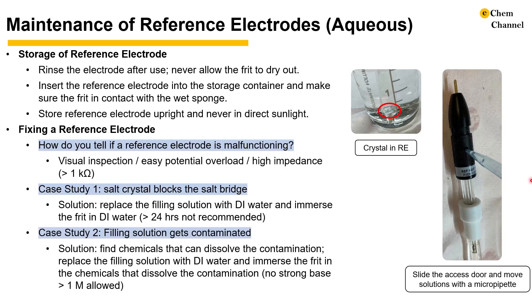If a chemical contaminates our reference electrode, we will need to identify the chemical and find a solvent that can dissolve it. As long as the solvent is not a base stronger than 1 molar potassium hydroxide, we can replace the filling solution with DI water and immerse the frit in the solution that dissolves the contaminating chemical. We do not recommend strong bases because they will dissolve the frit.